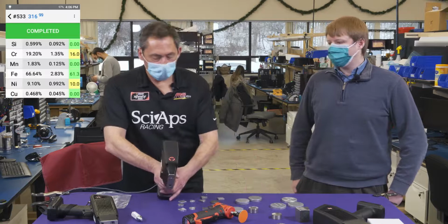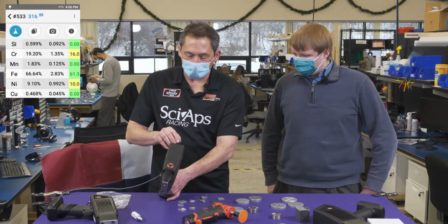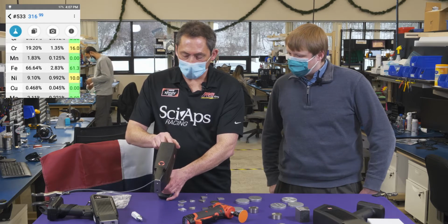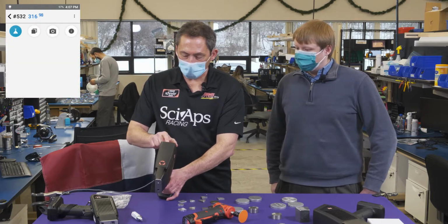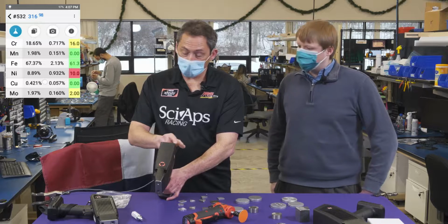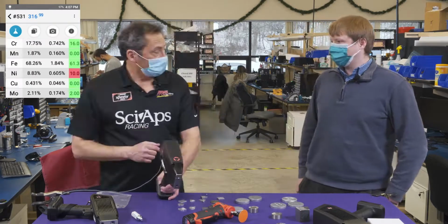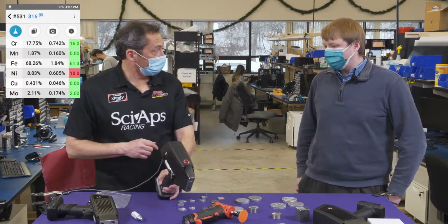So let's look at this, Brendan. Let's see what we got here. There's 3 tests on a 316, all good matches. So I like to look at the nickel, especially 9-1, 8-9, pretty good for air. 8-8. So, you know, it's still really, what do you think about that? Yeah, pretty good? Good repeatability.